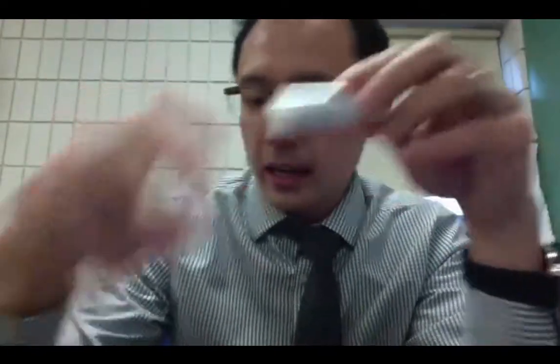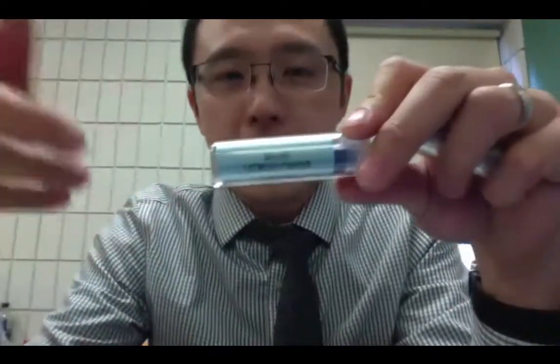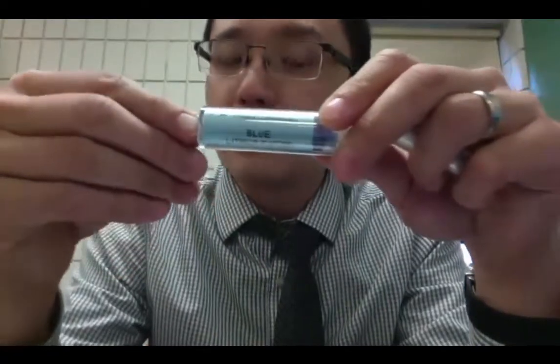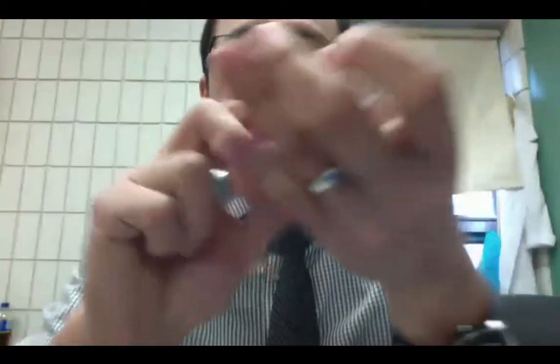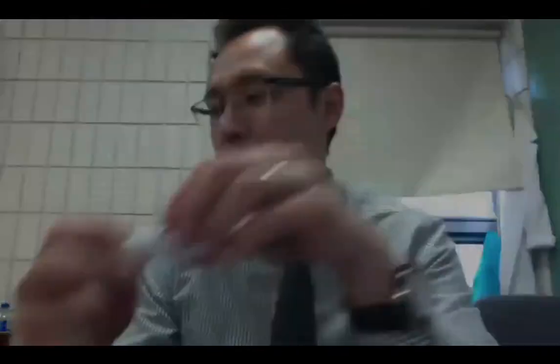So acidic will be the red one. That means your blue litmus paper will turn into red. So again, blue for base and this is blue. So if it's basic, it won't change color. And since this is red, it will change to blue if it is basic. So that's how you determine that.